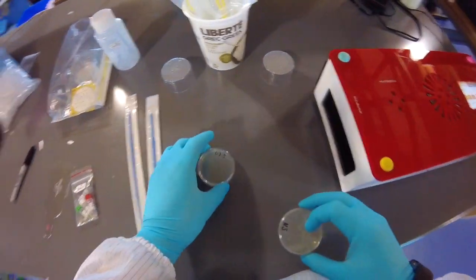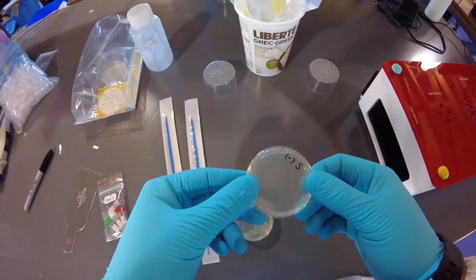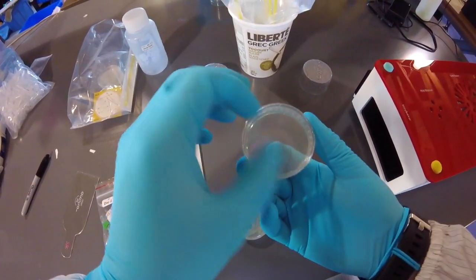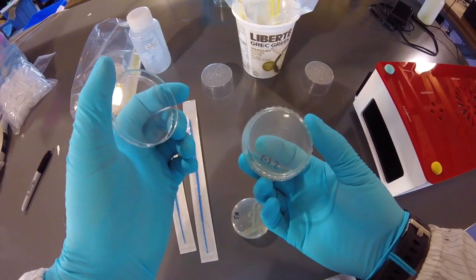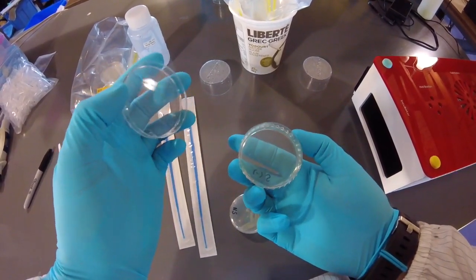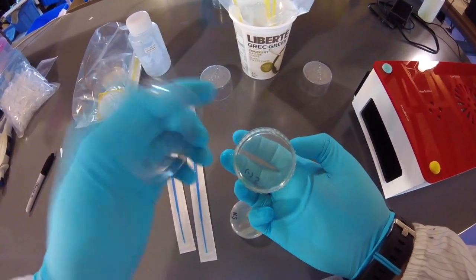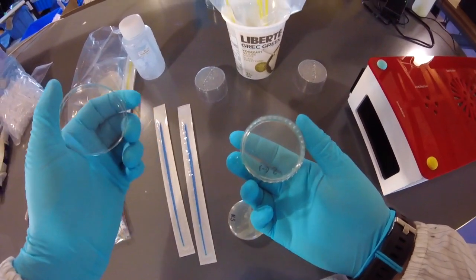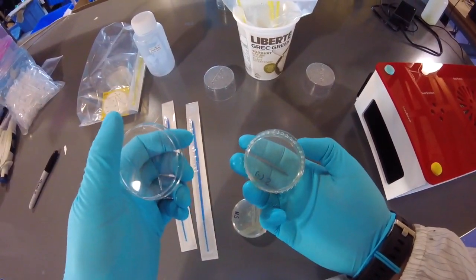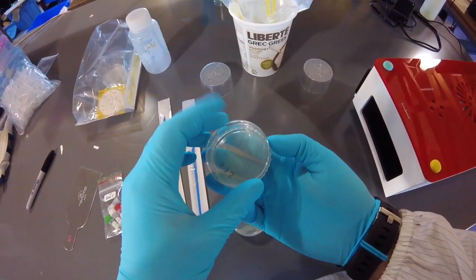Okay. You also remember our negative control plate, where we streaked blank cells on a Petri dish that has antibiotics. And the negative result is that nothing would grow because the blank cells don't have any resistance and the antibiotics would kill them. So as we can see, there's no cells growing despite putting lots on there. And this really signifies that the antibiotics are in there, they're active, and they're doing what they should do. So that's a great result right there.